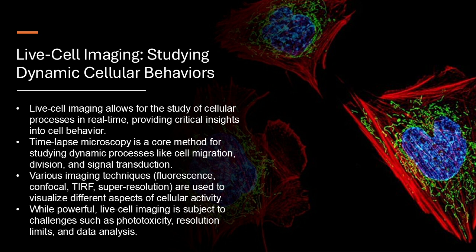It's all very impressive, but I'm curious, how are these techniques being used to tackle real-world challenges? How are these tools making a difference in areas like medicine and human health? That's a great question, and it's one that researchers are really actively exploring right now. For instance, take those microscopic chases we talked about earlier. Cell migration. Scientists are using live cell imaging to study this process in incredible detail, particularly in the context of cancer metastasis. Metastasis, that's when cancer spreads, right? Exactly. It's when cancer cells break away from the original tumor and travel to other parts of the body, establishing new tumors in distant organs. It's a complex and often devastating process. So how is live cell imaging helping us understand it?